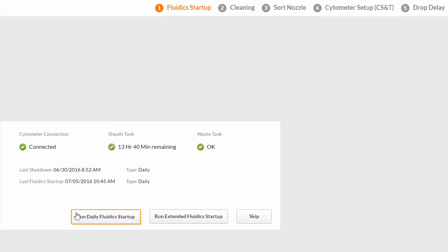The first workflow on the opening screen is Fluidics Startup. There are two choices: Run Daily Fluidics Startup or Run Extended Fluidics Startup. For this demonstration, we will perform a Daily Fluidics Startup.